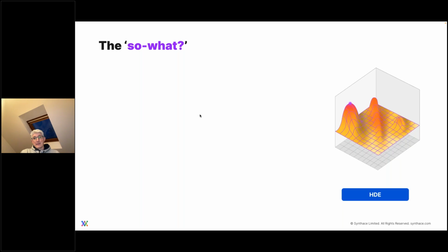We've seen this applied in many different areas, and I wanted to give you a bit of a flavor of that. Like I mentioned, assay development is an area where this can be very powerful, particularly assay development in the early parts of drug discovery. Because the output from these experiments is intended to be as miniaturized as possible, because this is often something that would then be used for, say, a high throughput screen where people would want to run these assays maybe 1 million times, then the desired output is something that would run, say, in a 1536 well plate. So that means that you can do the assay development in a similar kind of scale.